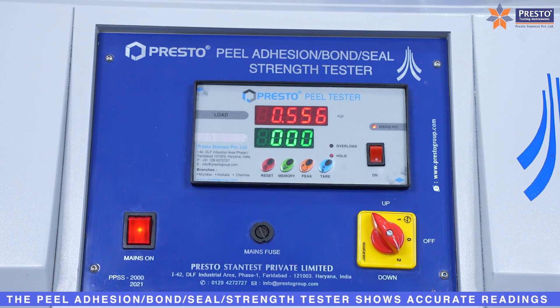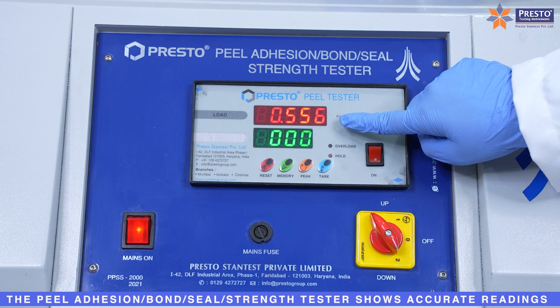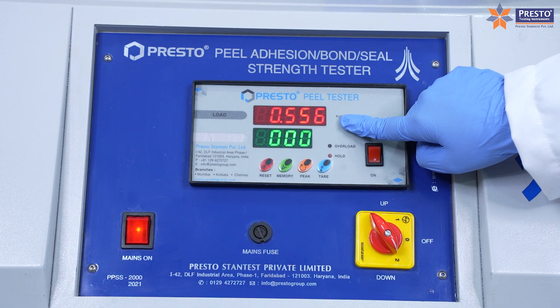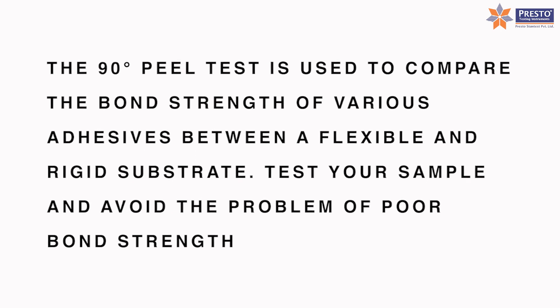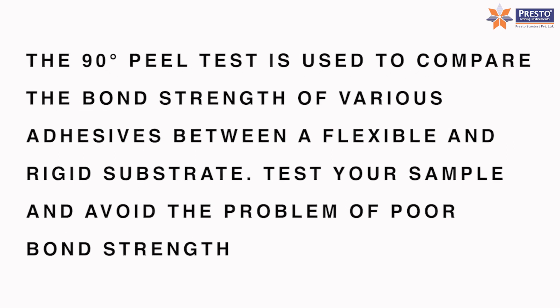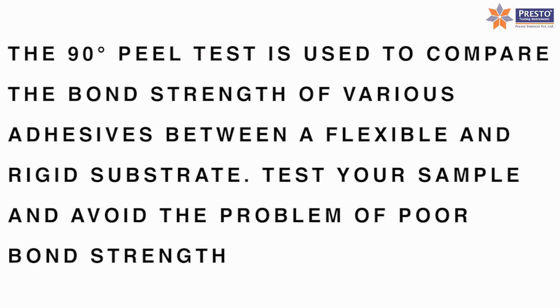The Peel Adhesion Bond Seal Strength Tester shows accurate readings. The 90 Degree Peel Test is used to compare the bond strength of various adhesives between a flexible and rigid substrate. Test your sample and avoid the problem of poor bond strength.